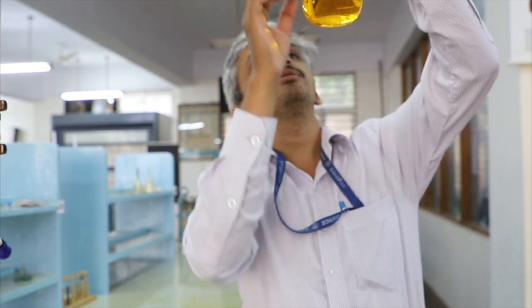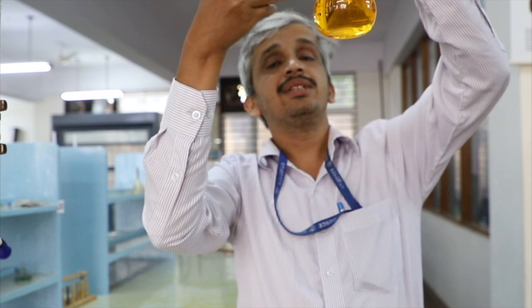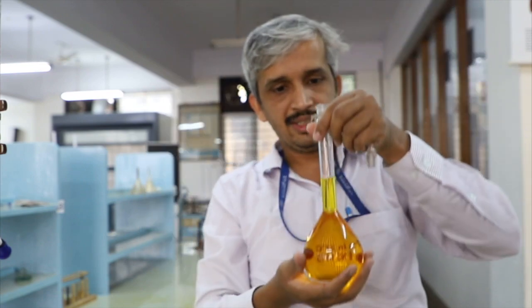Okay, so to avoid any parallax error, if I see from here, it looks like the solution is below the mark, and if I see from here, it looks like above the mark. So to avoid this parallax error, you have to keep exactly in line with your eyes. So it is exactly now. The total solution is exactly 250 ml.